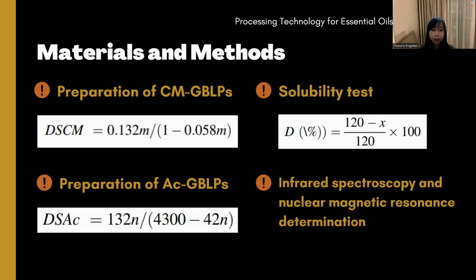4,000 per centimeter. And then the polysaccharide sample, 45 milligrams, was fully dissolved in 0.5 milliliter of heavy water at 99.99% in an ultrasonic water bath, and transferred to a nuclear magnetic tube for NMR analysis.